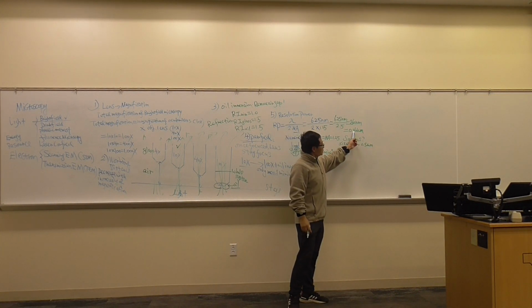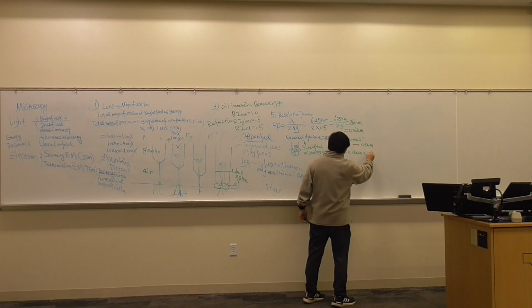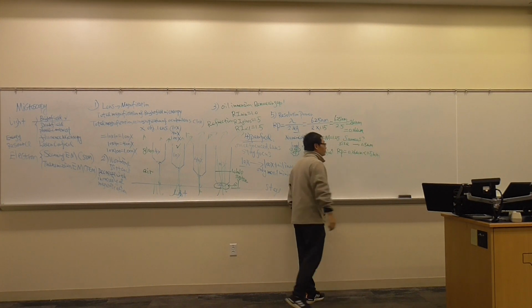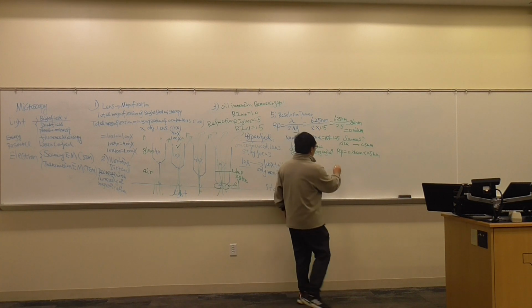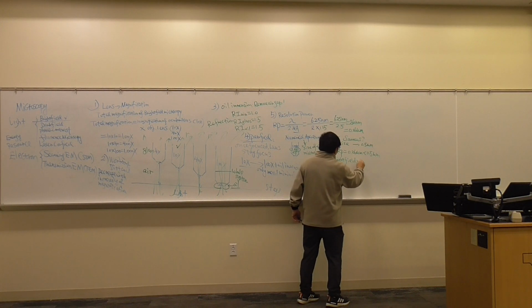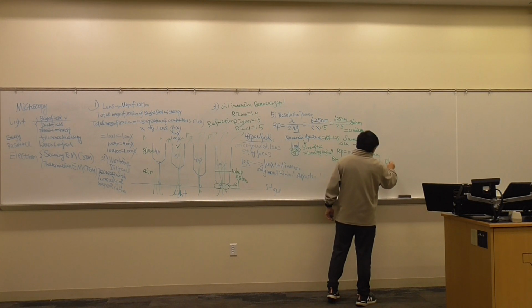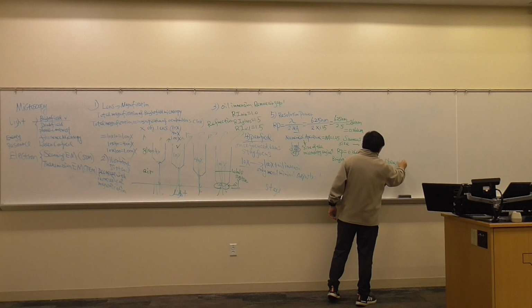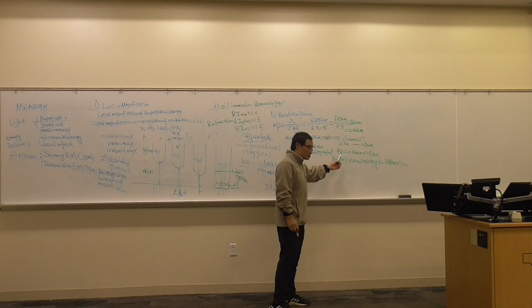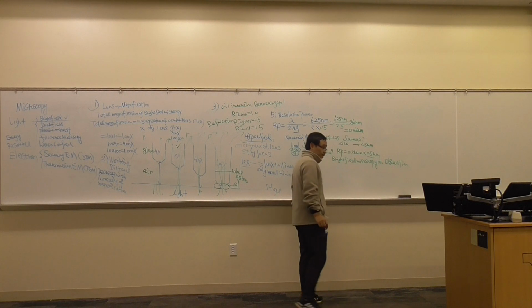This size is larger than the resolution power. The resolution power equals 0.26 micrometer, which is less than 0.5. Therefore, we could use a bright field microscope to do the observation, because the resolution power is less than the average size of the Staphylococcus aureus.